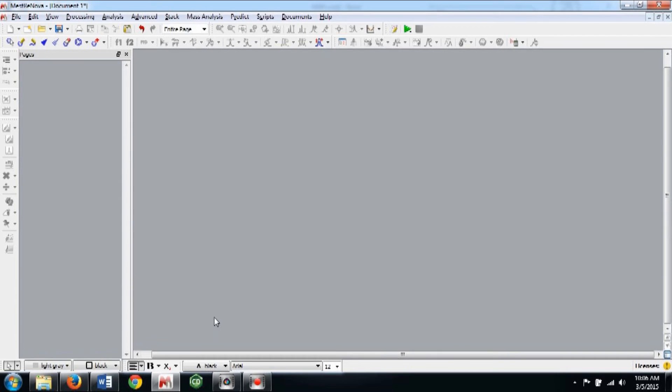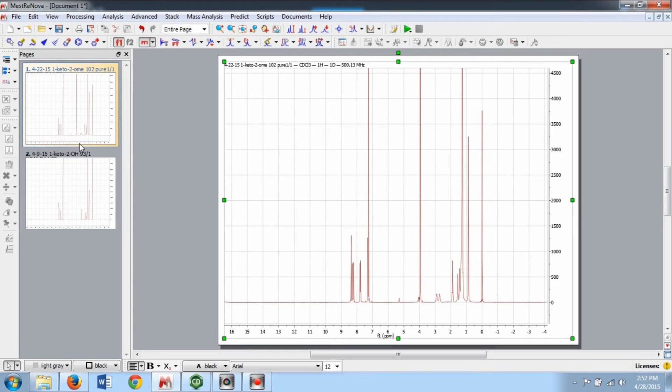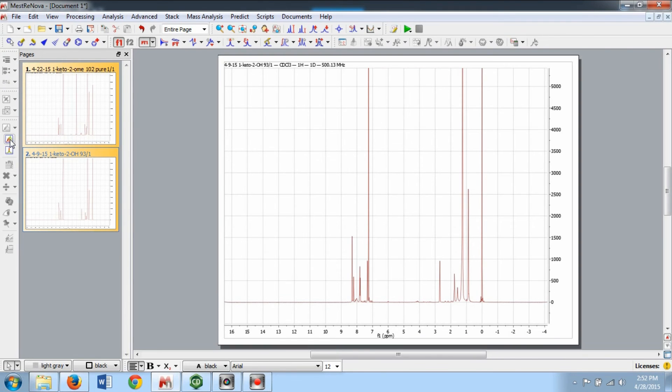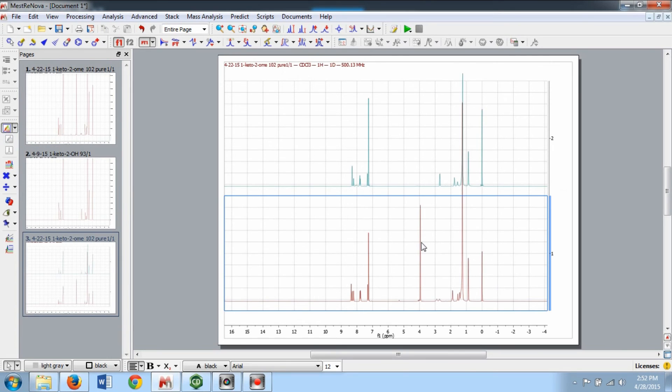The first set of features I'll show you are the Stack and Superimposed Spectra features. Selecting multiple spectra by holding CTRL or SHIFT and left clicking in the Pages section will make these options available on the left side of the screen.